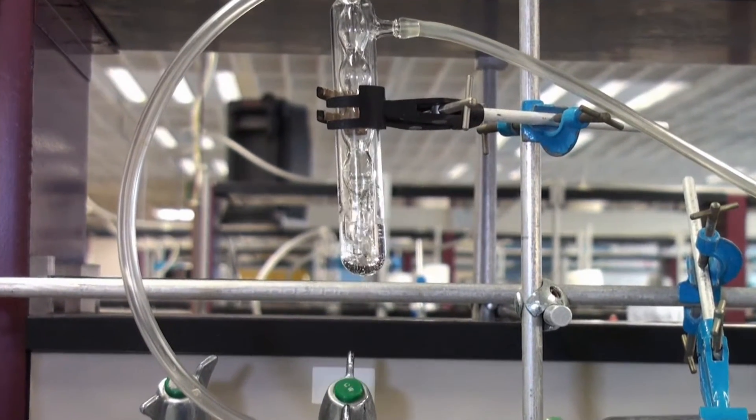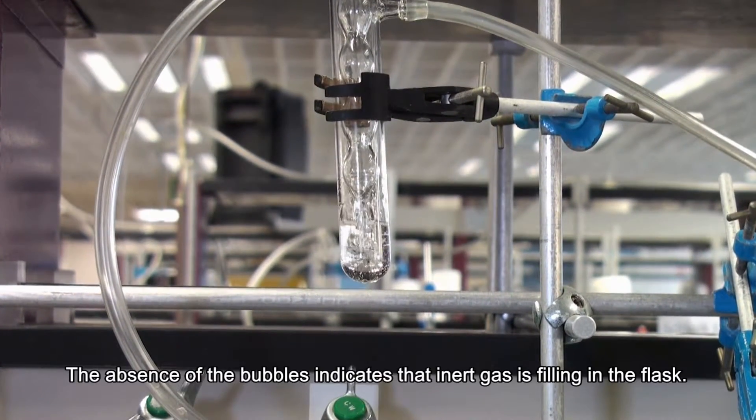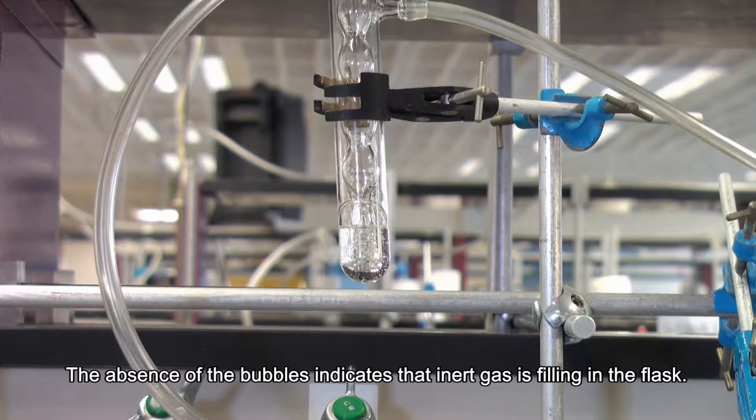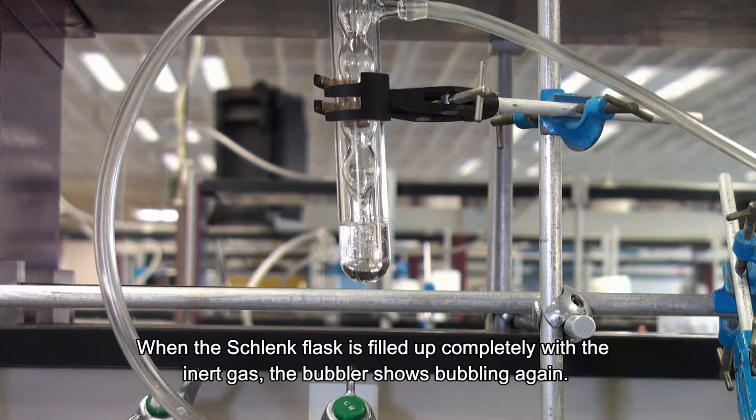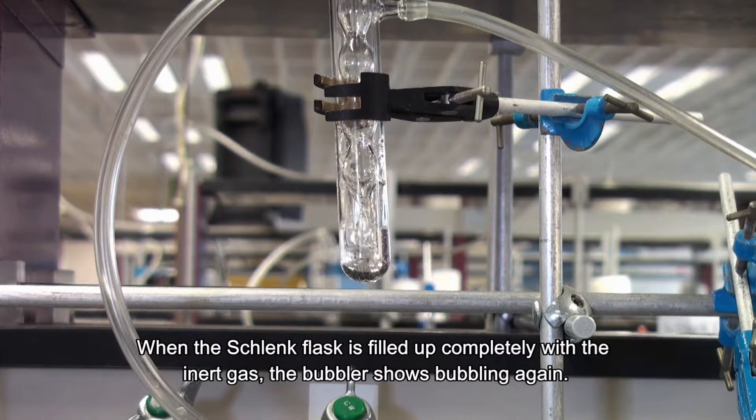Note at the bubbler. The absence of the bubbles indicates that inert gas is filling in the flask. When the Schlenk flask is filled up completely with the inert gas, the bubbler shows bubbling again.